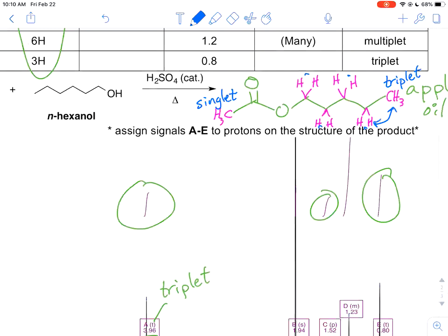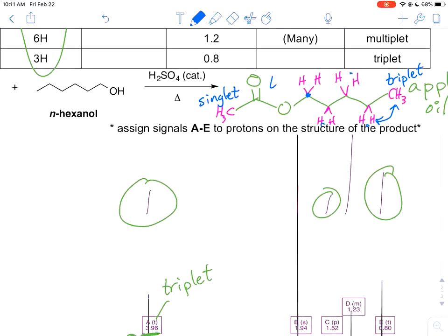The splitting patterns are going to be very useful for us for determining who's what. I'm not going to do every single one for reasons that will be clear in a moment, but I at least wanted to highlight that the two hydrogens next to the oxygen, the ones on this carbon, have two neighboring protons. So this one, these guys are also going to be triplets. Now the rest of the protons, all those CH2 groups, they are actually going to be pretty close in chemical shifts, and they all have a lot of neighbors. So, at minimum, the CH2 group right here is going to be a pentet. It has four neighbors. The CH2 group over here is also going to be a pentet. And then that CH2 group right there has three on one side, two on the other. That's a total of five neighbors. And so this would be a sextet.